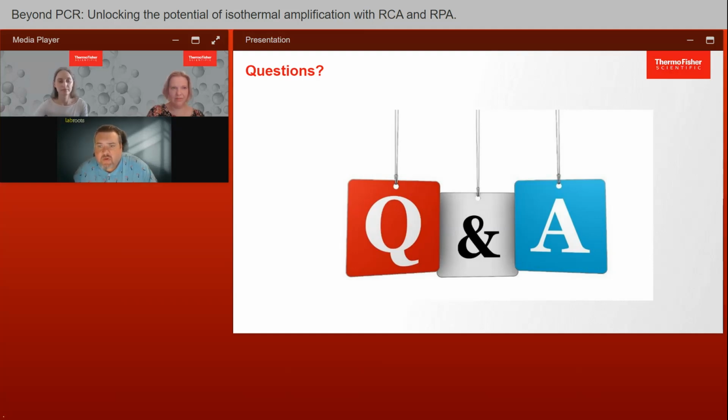All right, thank you. Next one for Rasa. Do you have the data on plant or seed pathogen detection assays using isothermal amplification techniques? Yes, we do. We have application notes using LAMP technique for plant pathogens, so we can find them on our webpage.